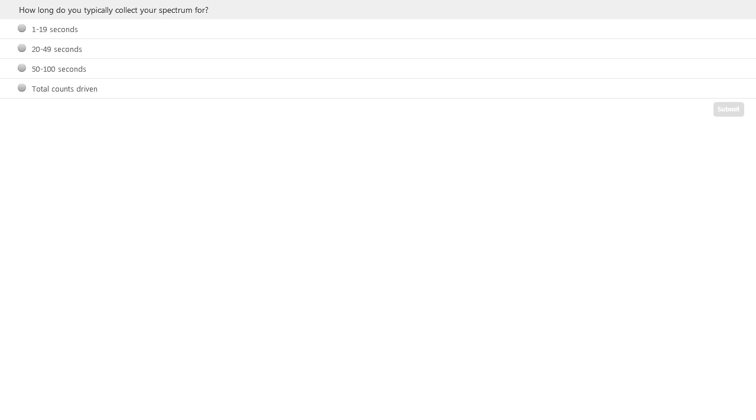We put the first few options as time-driven, and the last option is total counts-driven. So there might be some of you out there who are already more progressive and going with total counts as your ultimate goal. I'll just give another moment or two so that you can select your typical spectrum collection time.